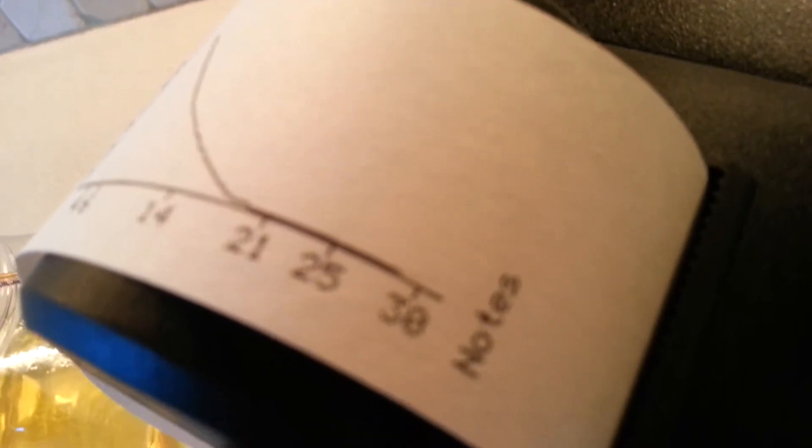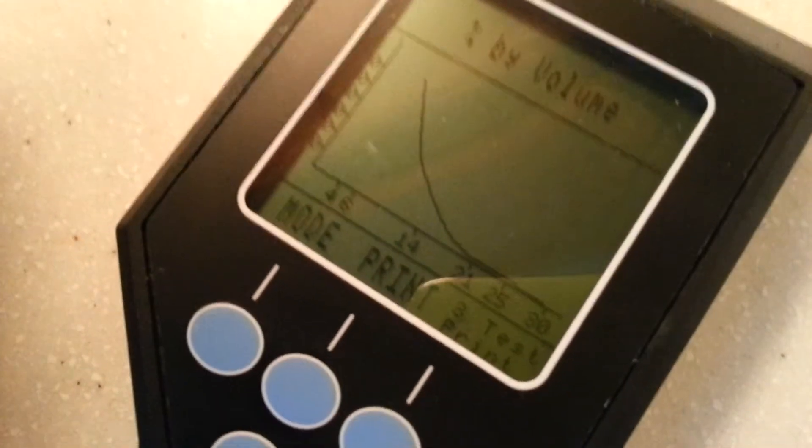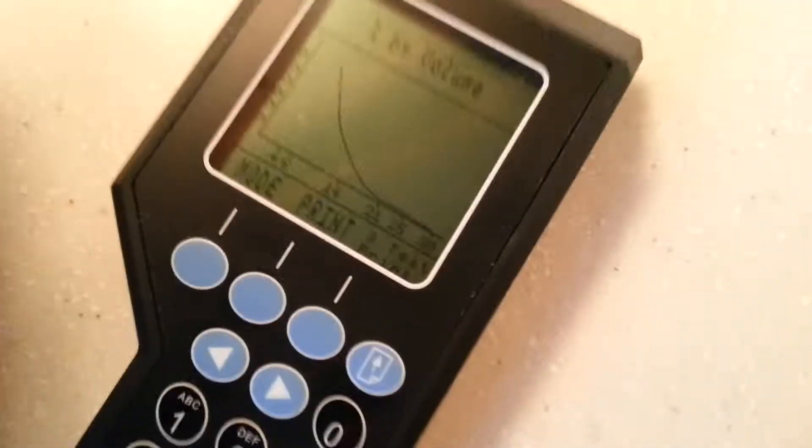As you can see, it's an exceptionally low count there, and we obviously have this indicated to us on our handheld unit, so it's telling us it's 64% made up of our 4 micron levels.